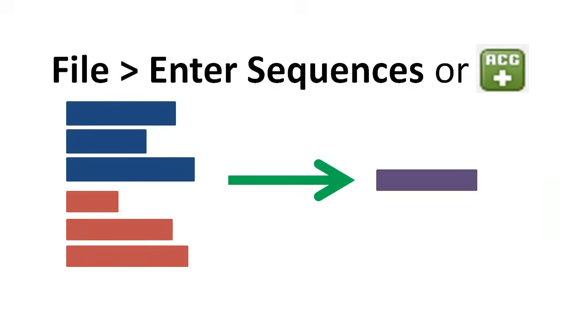If we enter these sequences using File, Enter Sequences, or the corresponding button, we will end up aligning the parts to one another.